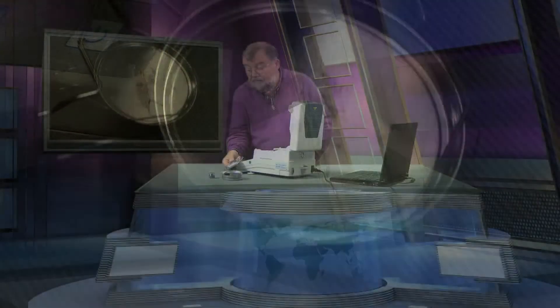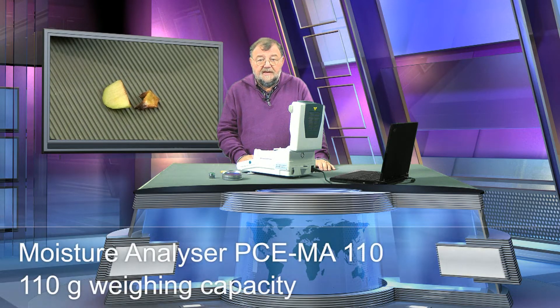It is naturally still hot. But look here — that is the piece of apple afterwards. And that is the piece before. And you saw as well how high the moisture proportion was. A very tricky device, this MA110 from PCE.